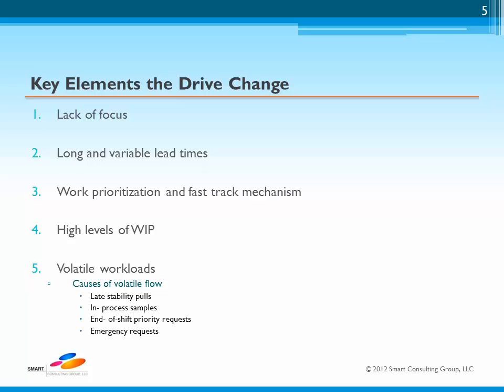This is done by clearly identifying which steps add value to the process and which do not. In doing this and mapping the results, each step of the process becomes a logical integrated step in the flow. Together with controlling the workload and mix of samples arriving, it is possible to level the workload and reduce or eliminate many non-added value elements which previously were a drag on the efficient system.